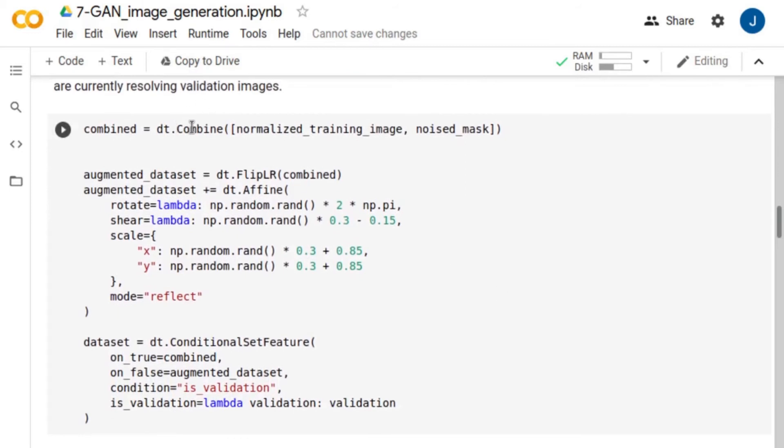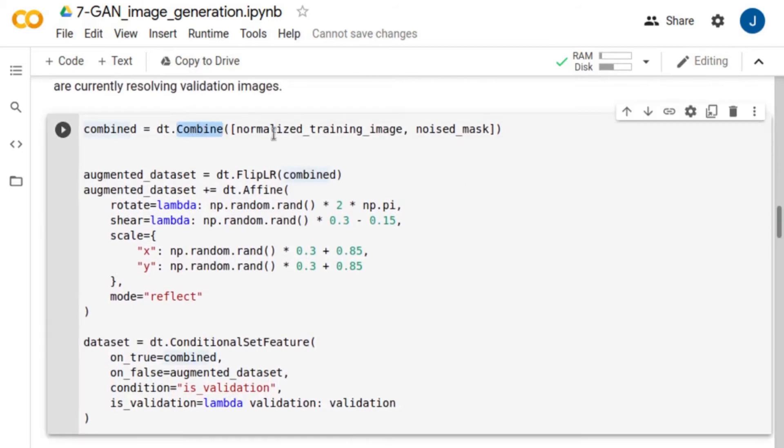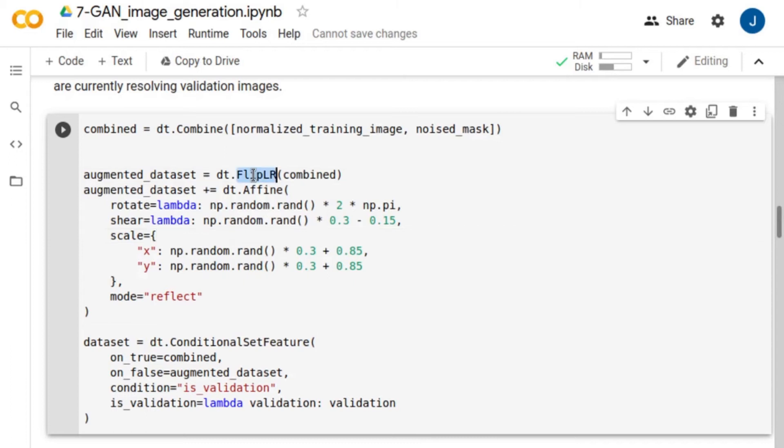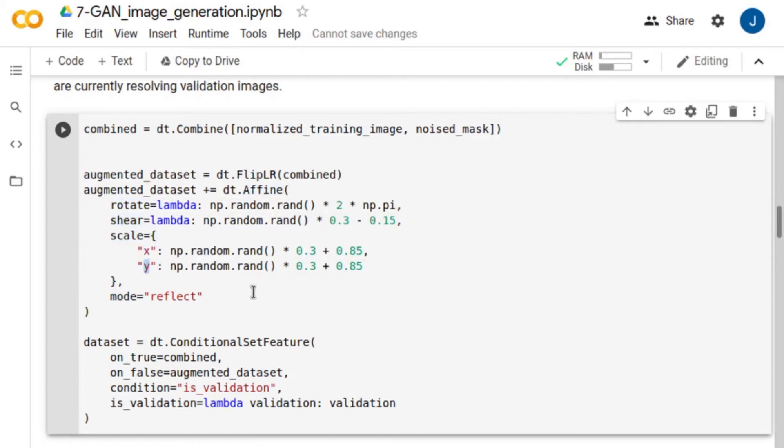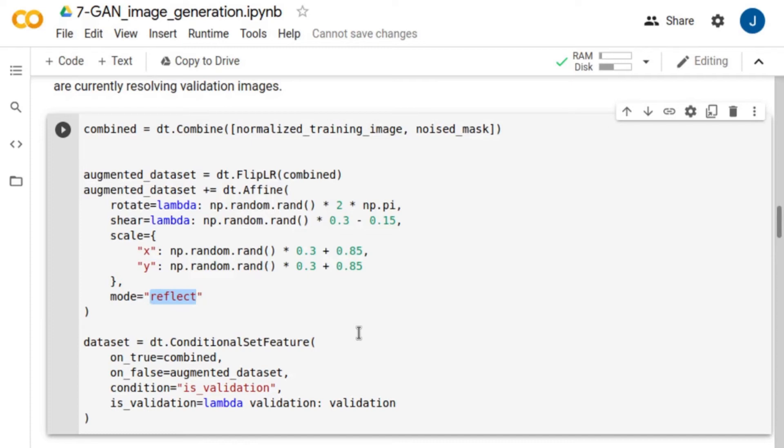Then we combine the normalized cell images and the noisy mask into a single dataset and apply some augmentation to the images, including left-right flipping and affine transformations that involve random rotations, load-moderate shearing and scaling in both x and y directions. Note that the missing pixels in the transformed images are filled in by mirror reflections of the images.